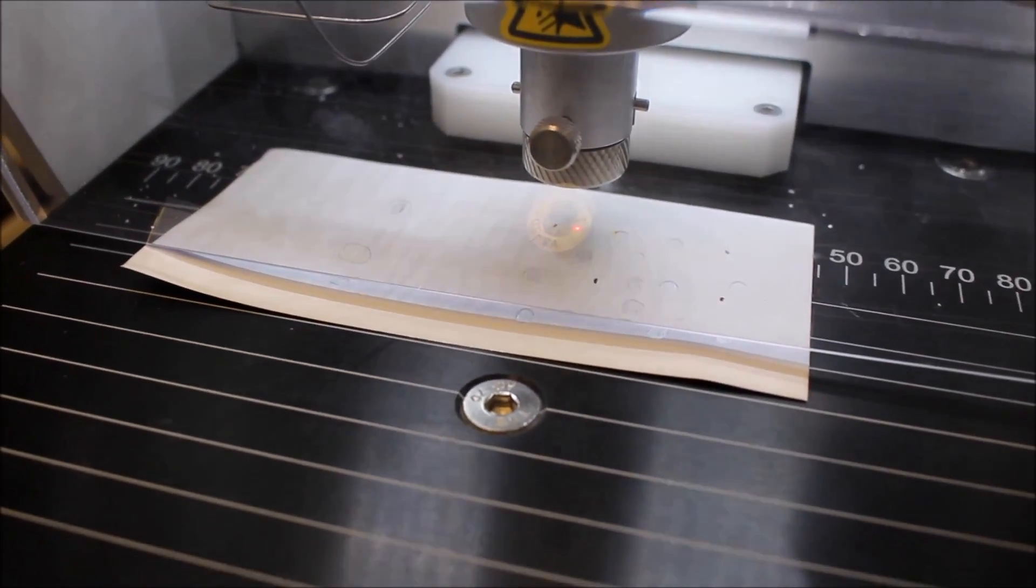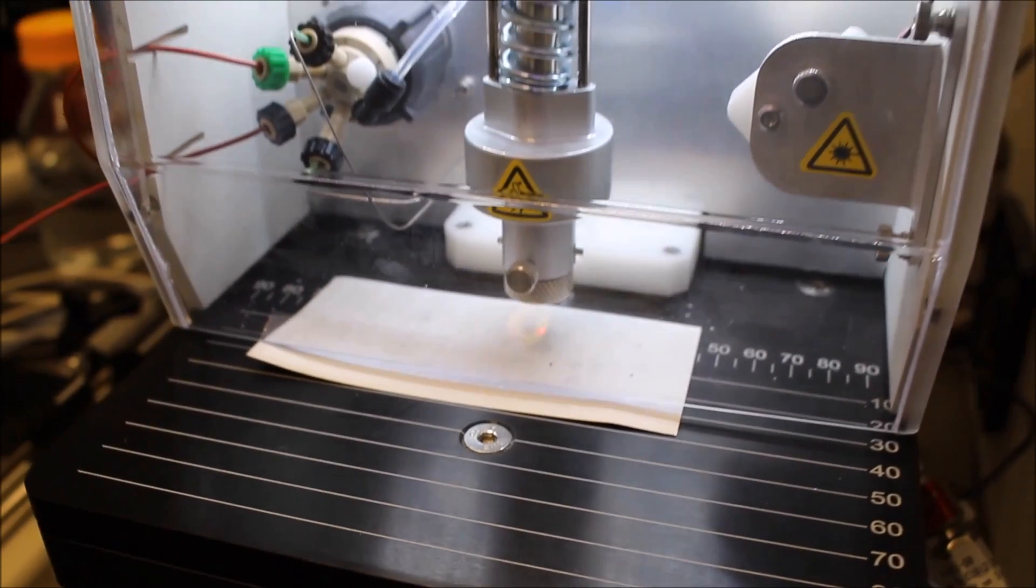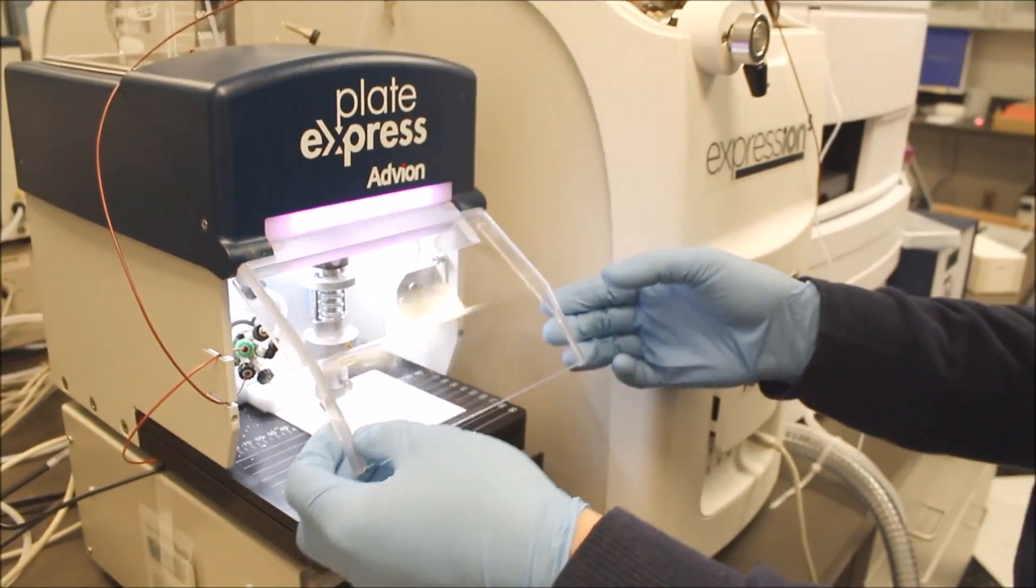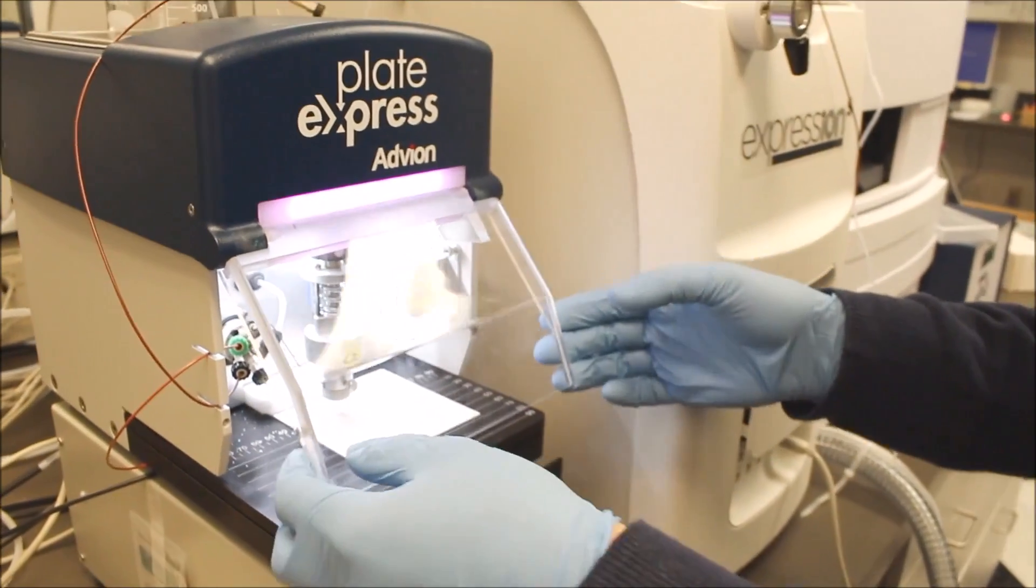The TLC spot contains the ideal amount of sample for mass spectrometry, so analyzing directly from the TLC plate is an ideal format to avoid overloading the mass spectrometer. Decoupling the separation from the analysis avoids system bottlenecks.